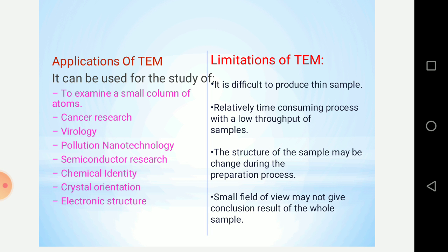Pollution nanotechnology means we know that different particles, meaning airborne particles, cause different types of pollution. So we can observe different types of particles which can cause pollution in the environment by using a transmission electron microscope.